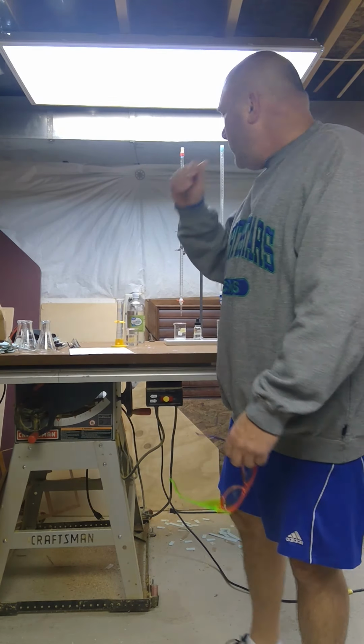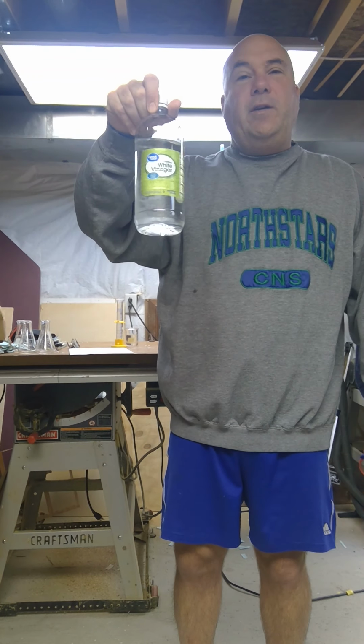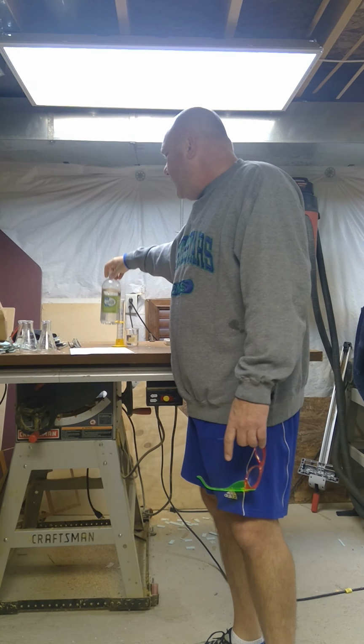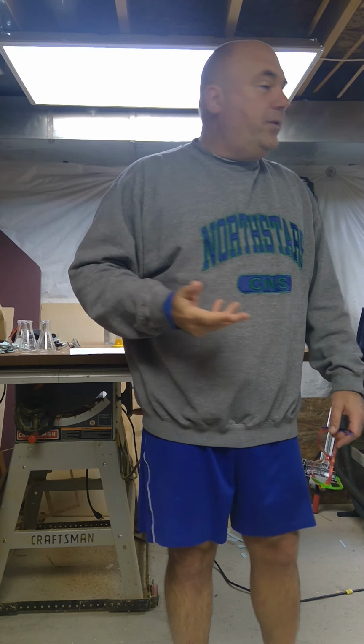So what we're going to do is we're going to be analyzing white vinegar today. We're going to see if we can figure out the concentration. Now in vinegar, this is acetic acid, which is a weak acid. So that's the plan for today.